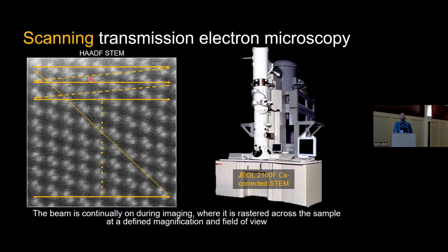It's a scanning method. At each pixel in the image, which are typically on the size of 512 by 512 or 1K by 1K images, you can obviously go higher, you can obviously go lower, we're acquiring it row by row before doing what we call a flyback to go to the next row, and then again, going for more rows. So we have a full image, and then if you're doing video, you have a frame flyback to go back to the beginning.